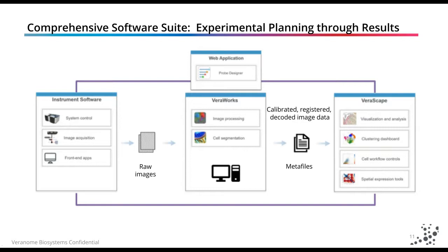And then we have an image analysis pipeline that automatically does all of the image processing, extracts the individual features, and quantifies the RNA molecules. Then individual biologists can take that data that was generated and visualize those results, conduct t-SNE, UMAP, or other clustering methods, and develop cell-based workflows that Dr. Hilbush will go through in subsequent slides.